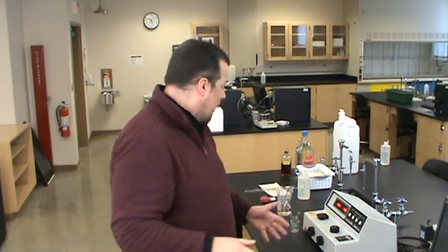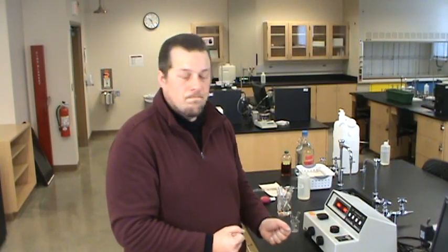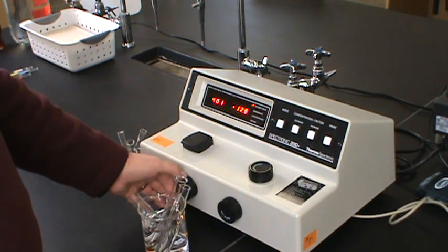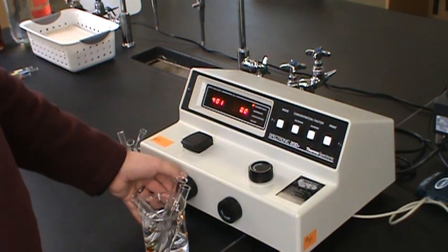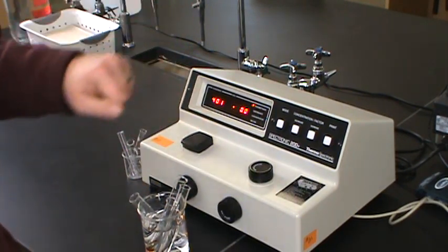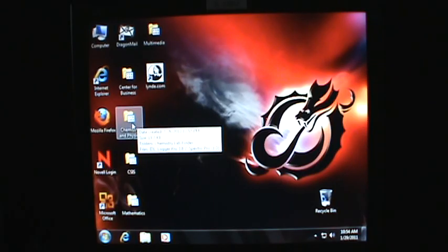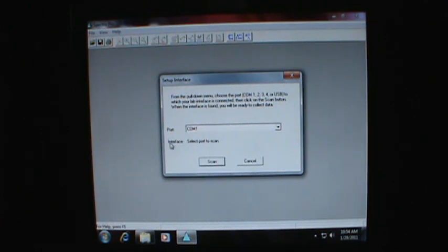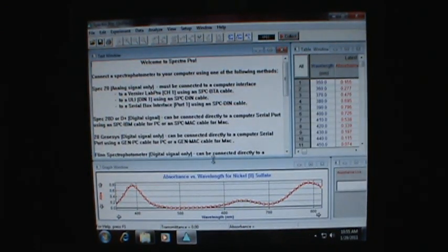So I think I'm just about ready for a run. I have my samples ready. Got my spec 20 turned on and it looks like I need to calibrate it. My zero is good. I'll do my 100% in a minute. Let's get the computer set up. On the desktop, we should be able to go to chemistry and physics. We're using a spectrometer, so SpectroPro. You may come up with this dialog box to set up interface. If you do, click scan and wait until it pops up the Thermospectronic 20D interface. That's our spectrometer. We're ready to go.